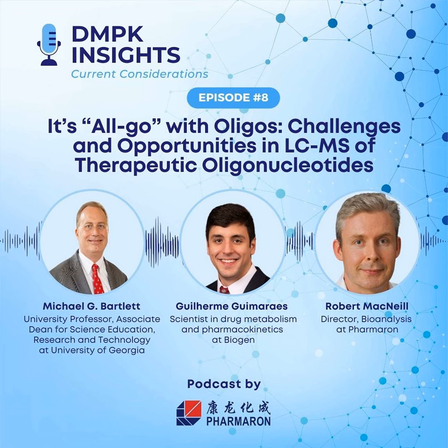And so I think being able to introduce HILIC methods is going to draw so many more people into the field that I think we're actually held up by the use of ion pair reverse phase because they just didn't want to deal with the challenges in the instrumentation. And I also think it caused a lot more people to stay with ELISA and qPCR methods because they didn't want to move to the LC-MS methods because they didn't want to deal with those kind of challenges. And so I think HILIC is going to have a lot of other downstream effects on the field here as well.